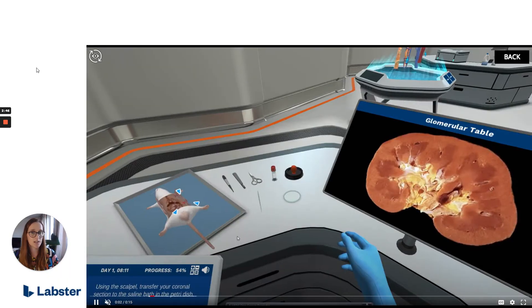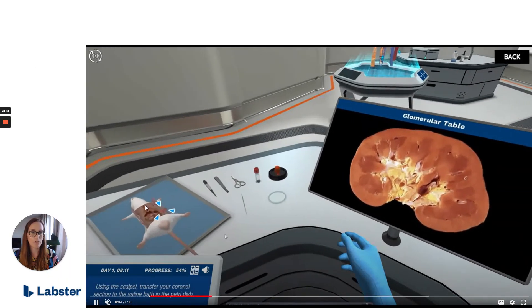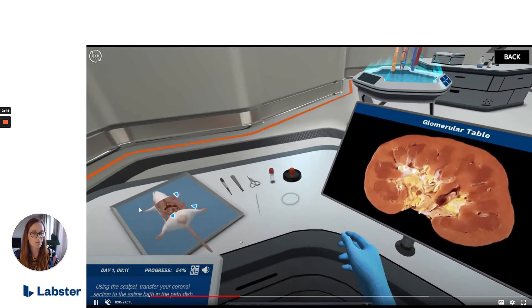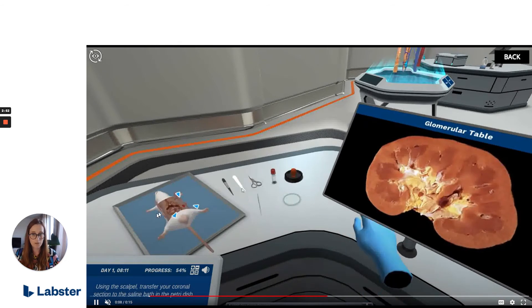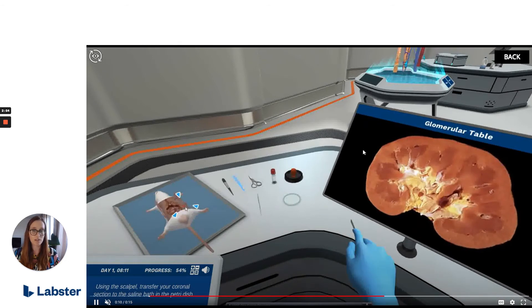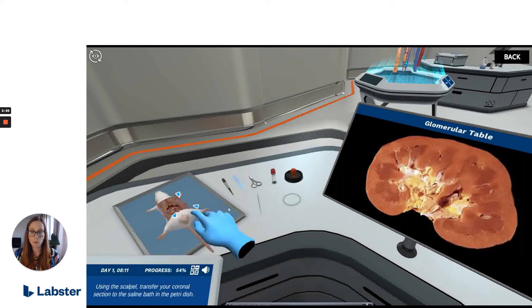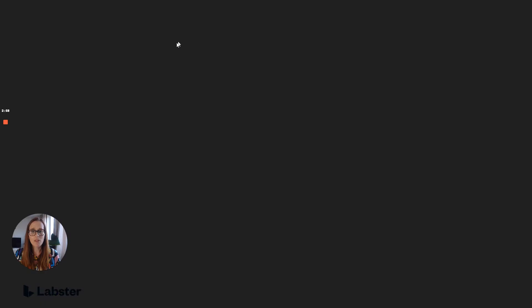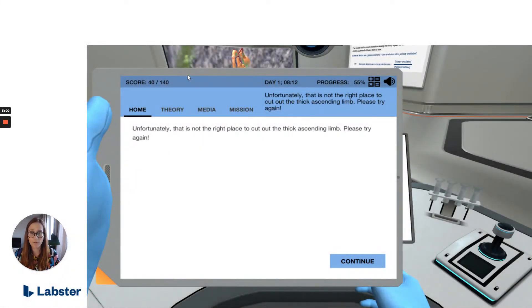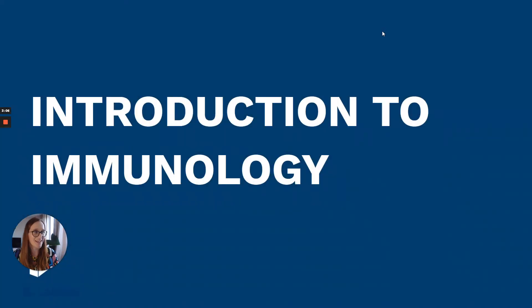We adjusted the viewing angle at the rat dissection experiment to allow for more user-friendly interaction and made sure the screens are all in one view. Throughout the simulation, we improved the instructions, feedback, and hints for a better learning experience.